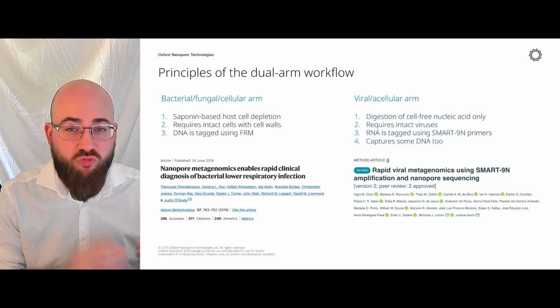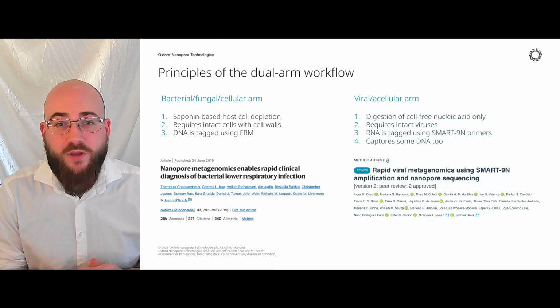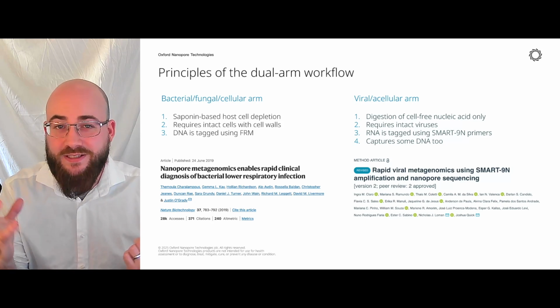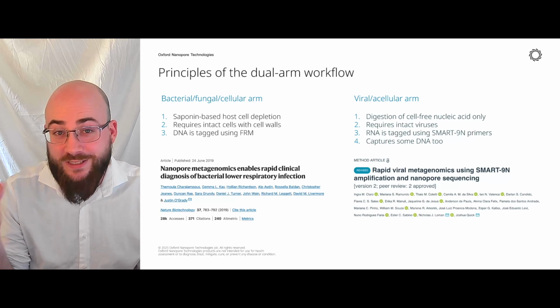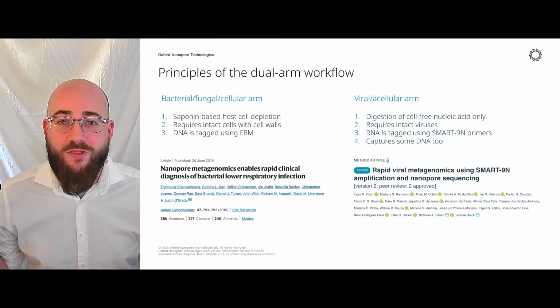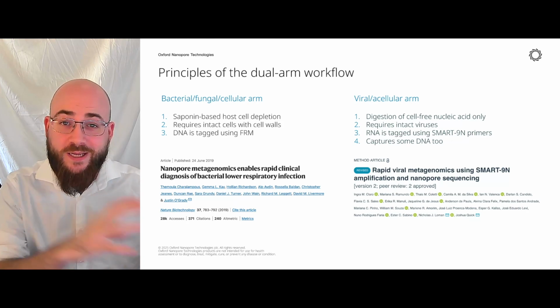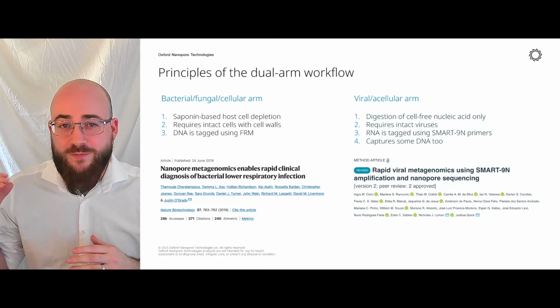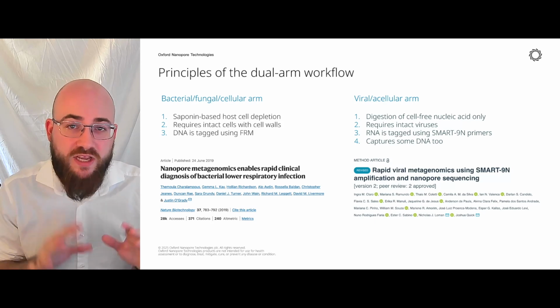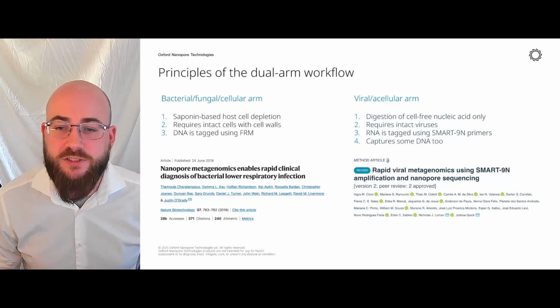We need to really reduce the amount of human background in there, because otherwise we're talking about looking for a needle in a haystack, right? Then the size of a bacterial cell compared to the size of the genome, at least, of a human cell, it's a big difference. You then think about how many bacterial or fungal cells you might be finding in a sample that's taken compared to how many human samples in there. That needle's now a grain of sand in the ocean. So it's really hard to look for them without doing a really efficient and good high quality depletion.